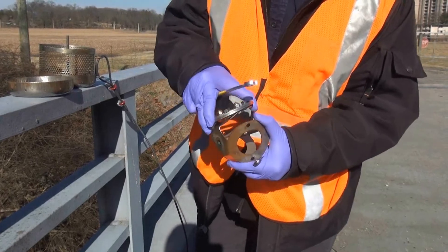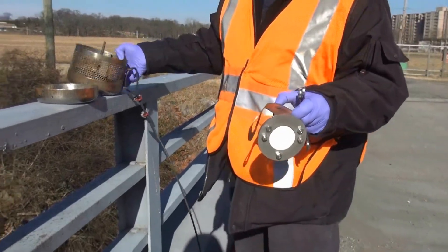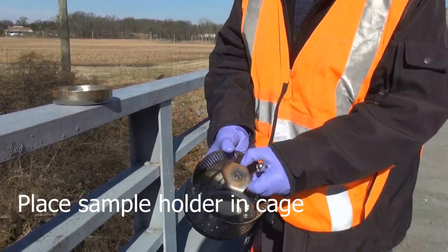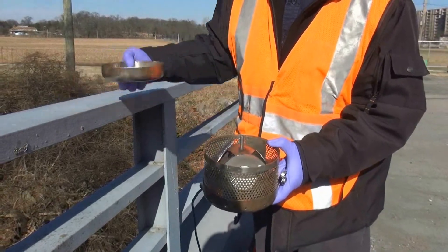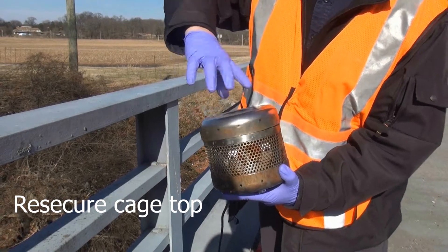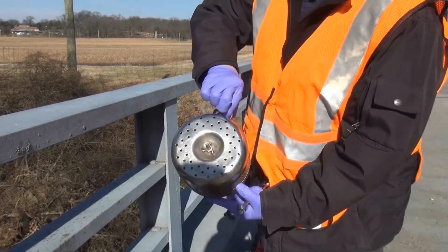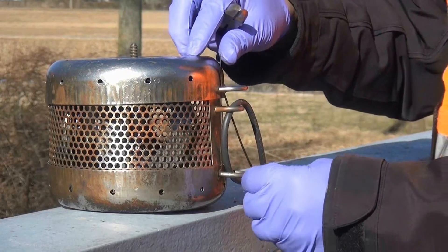Make sure the bolts are tight. Place the sample holder in the cage, screw on the cage top, and secure the top with a zip tie.